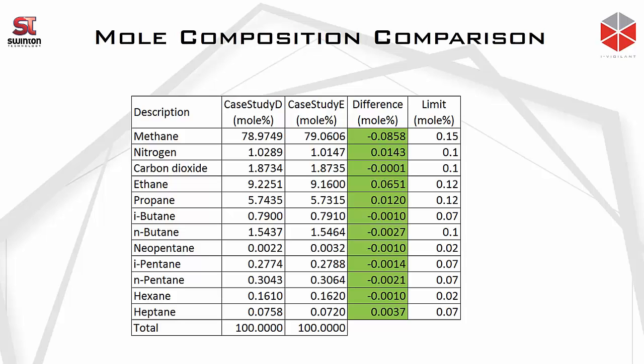It's all right to perform a reproducibility test in comparison between a spot sample and the GC reading, but when you have two GCs calibrated with the same calibration gas, we need to work based on the CV data comparison rather than the ASTM D1945 limit.